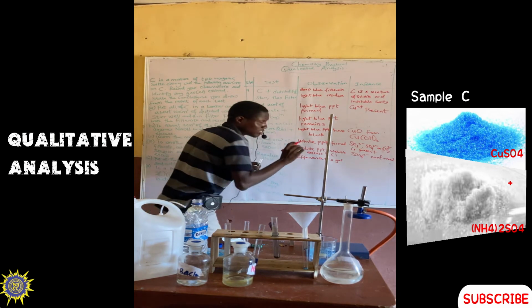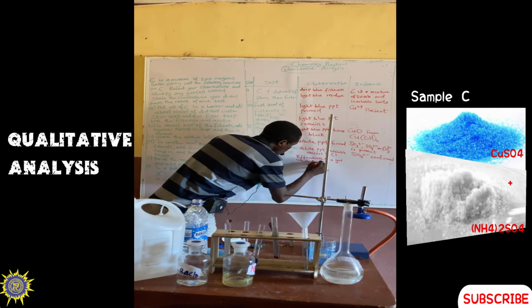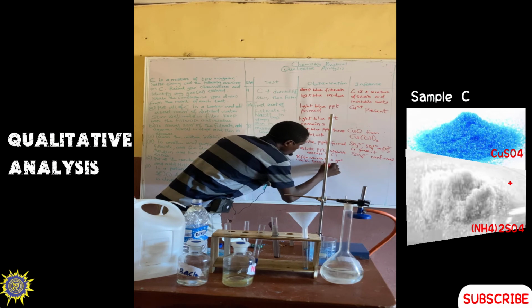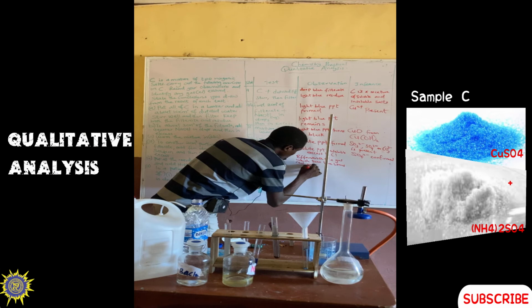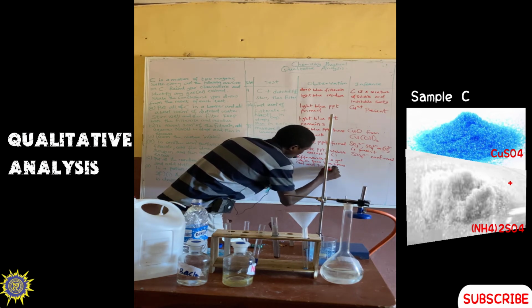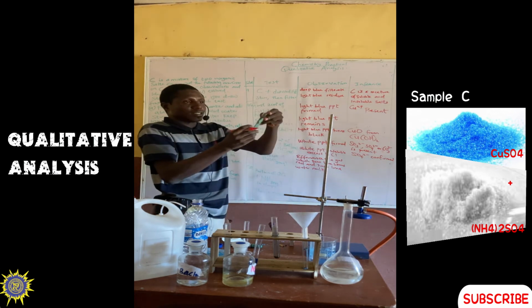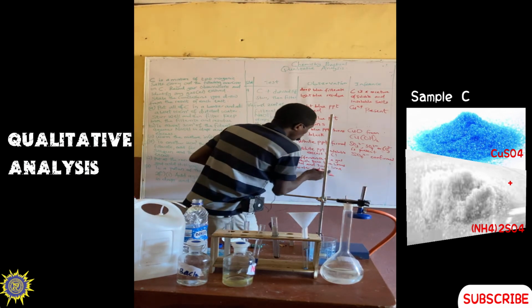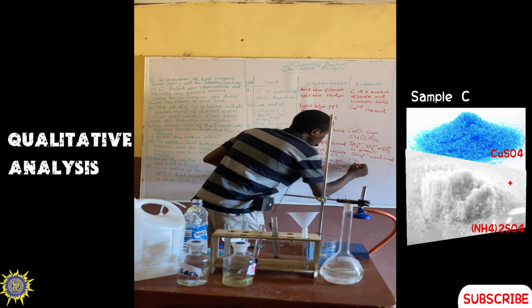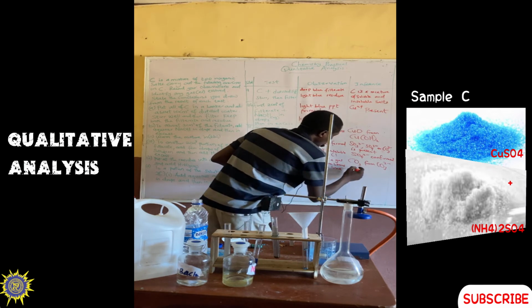So those are the characteristics of CO2. Evolution of a gas which turns blue litmus red and turns lime water milky. You can see complete effervescence has taken place. So what does that mean now? We have CO2 from CO3 2 minus. Confirmed.